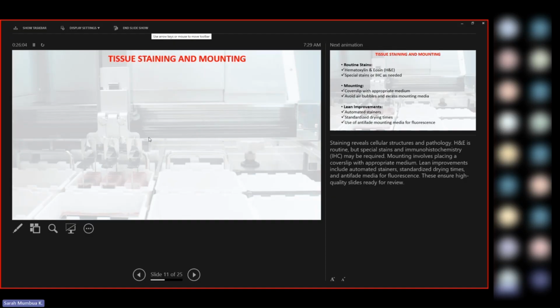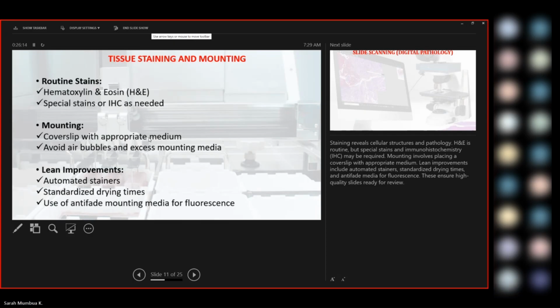So here we are going to do our staining. I said most labs have the auto stainers. If you do not have the auto stainer, you can always do the chamber. You can improvise, or you can buy. There are some already in the market that are well set. They have jars inside, a metallic chamber that has those jars inside, as many as you require.